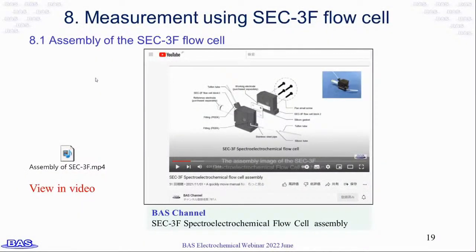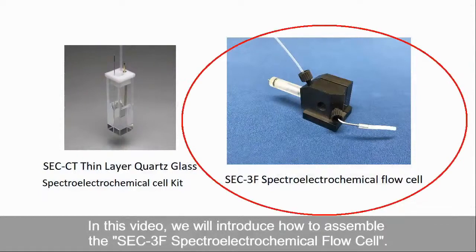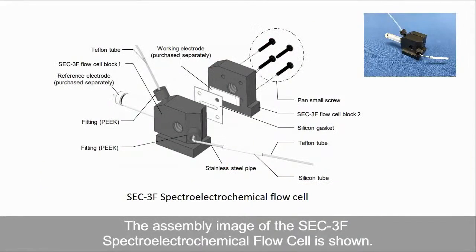Next, I will show you how to assemble the SEC3F flow cell by video. You can also watch the video on our BAS channel. For the spectroelectrochemical cells there are batch type SECCT and flow type SEC3F. In this video, we will introduce how to assemble the SEC3F spectroelectrochemical flow cell. The assembly image of the SEC3F spectroelectrochemical flow cell is shown.